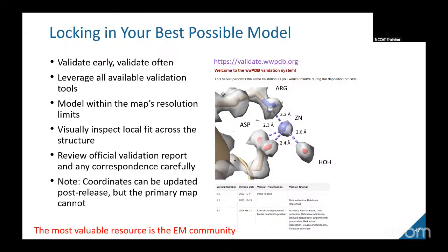And if you're really careful with validation, chances are you've already done this on the validation server. So I was talking to a group recently, and they said somehow it needs to be better streamlined. There is a local version of the Validation Suite, but it was last updated in 2004. Ah, is that true? Oh, that's embarrassing. I'm going to claim that's not true, but I'll get back to you on that. I can go back and raise some alarms.